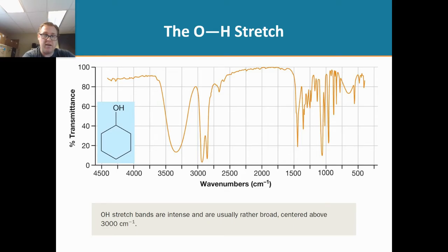It goes from like 3600 all the way down to close to 3000. That is an alcohol. That's a key indicator, and so that is the OH stretch right here. That's what we're looking at. This stretch right here represents that right there. That just jumped out at us, right?